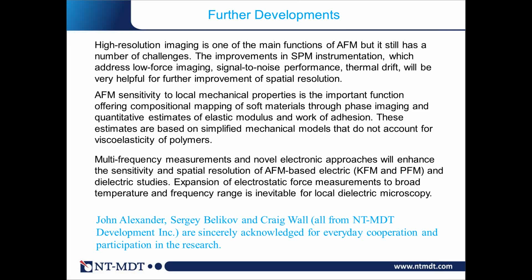Okay, that's a good question, because this is again part of this QNM process, and a lot of companies, including us, have a way to characterize the stiffness through the thermal tune. These are procedures and routines already in the NT-MDT software.